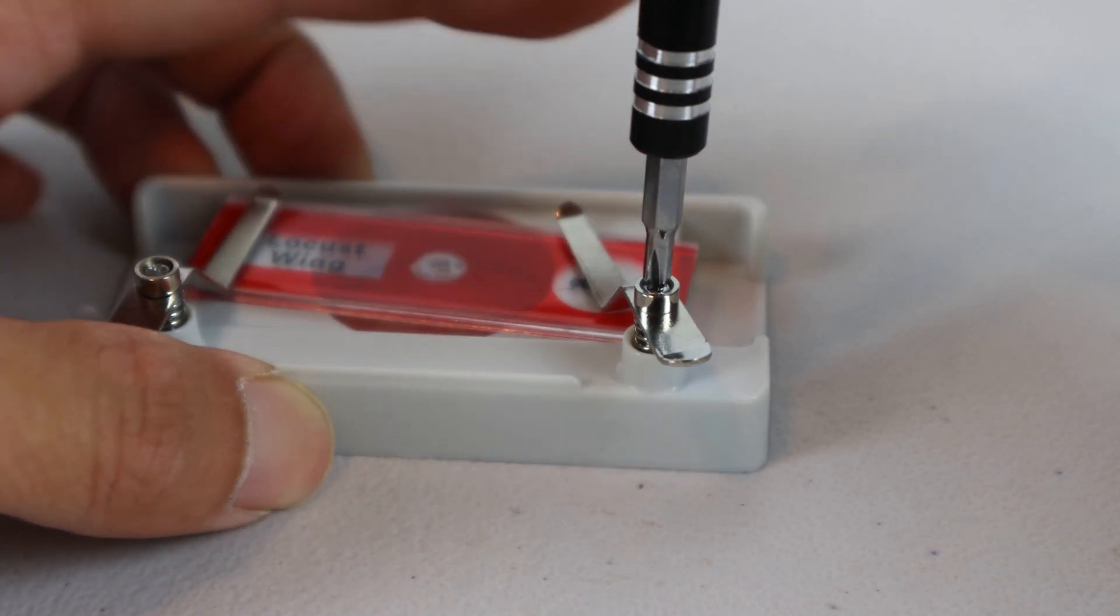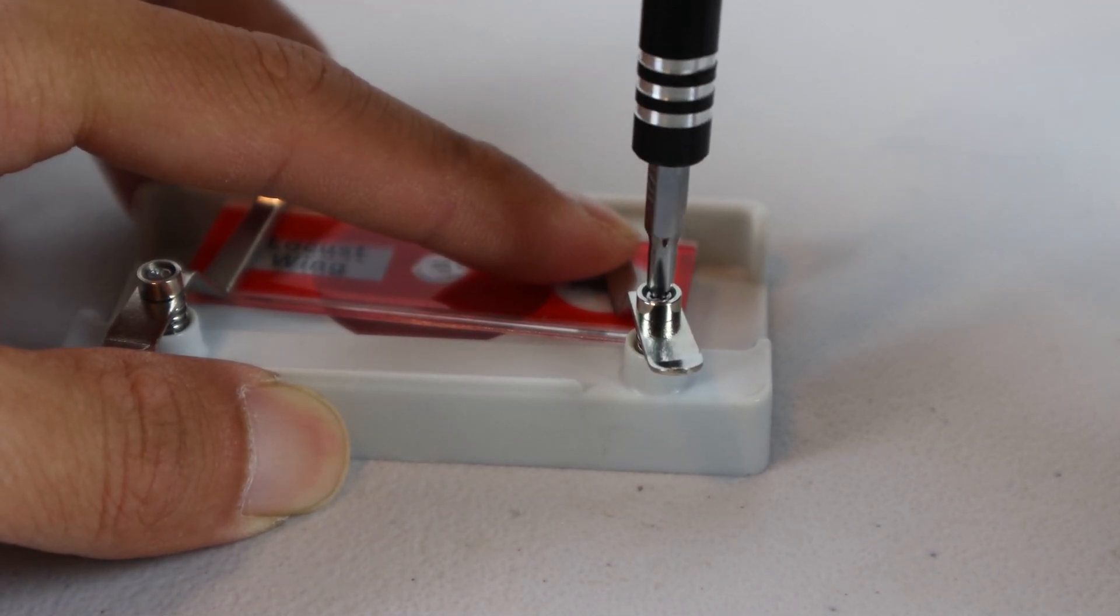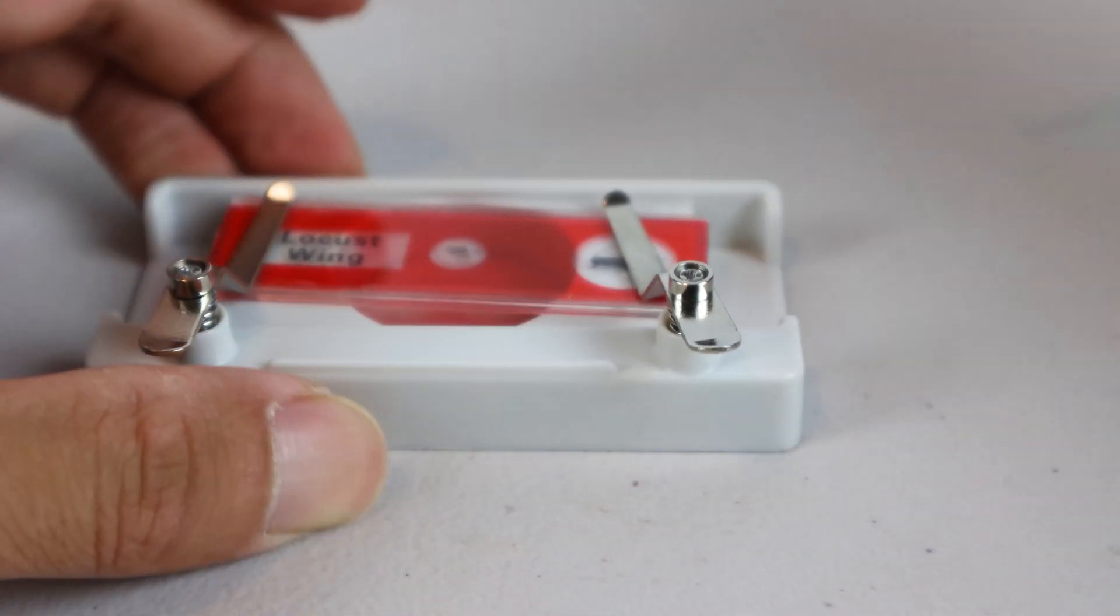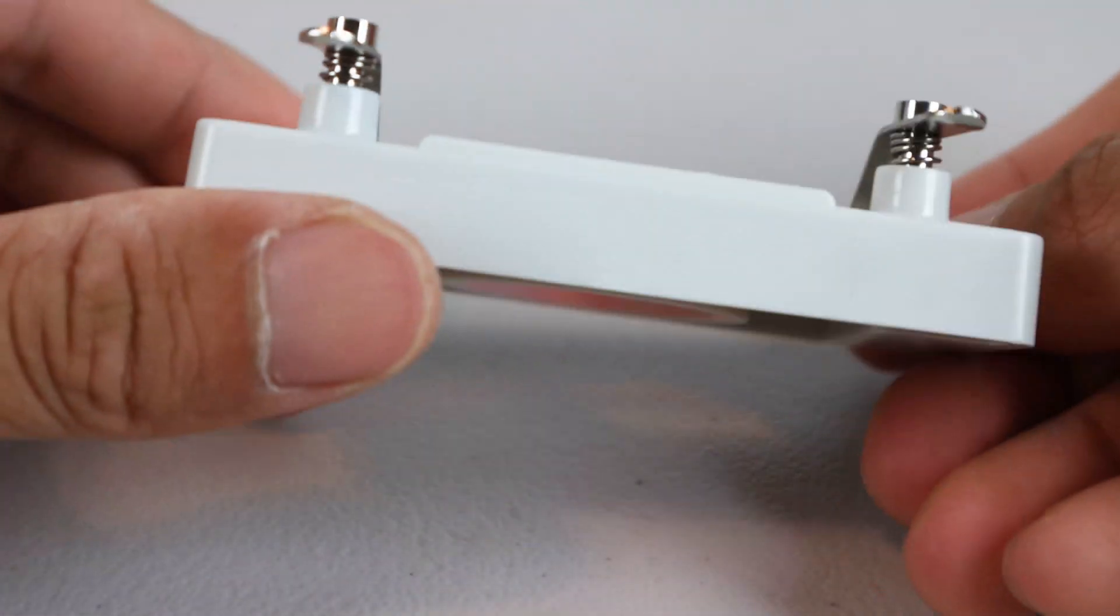So what we'll do is grab a small screwdriver and tighten the screws at the springs to lower them a bit and provide more tension. Now the clips firmly clamp the slide and it doesn't move around easily or fall off the block.